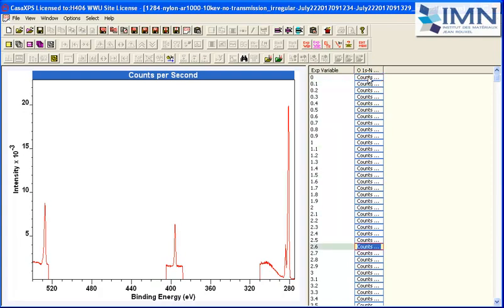So these are going to be synthetic spectra, but we're looking for characteristics of the initial state where we think we've got nylon, and some form that would represent what has been removed by the sputtering process.